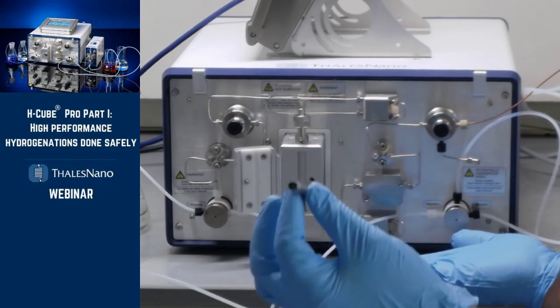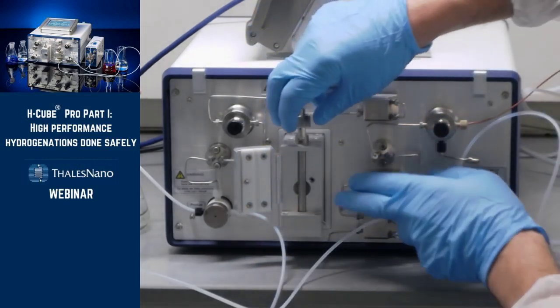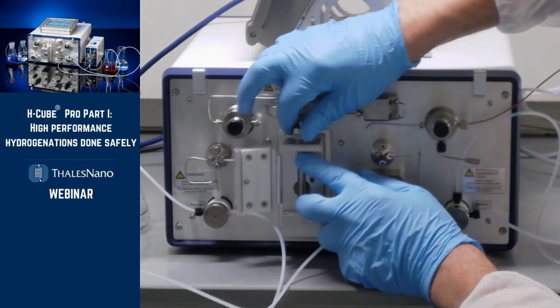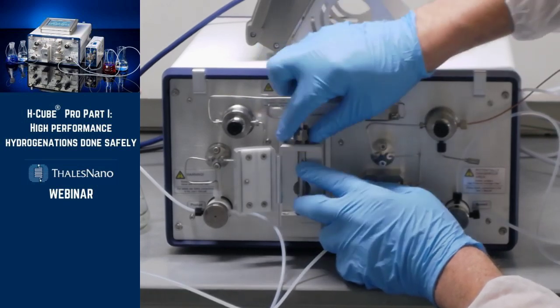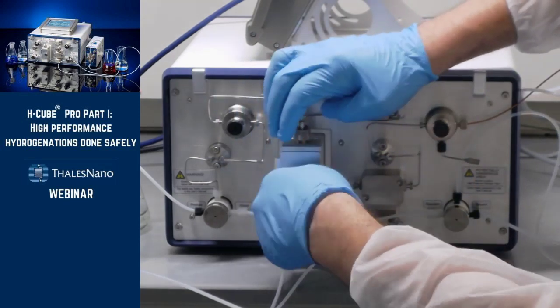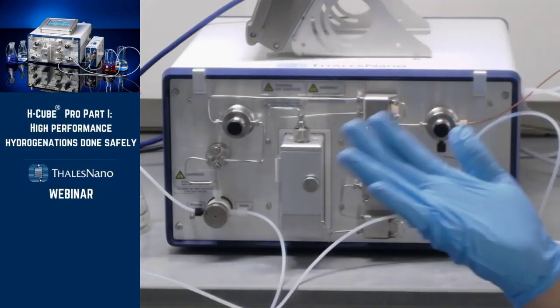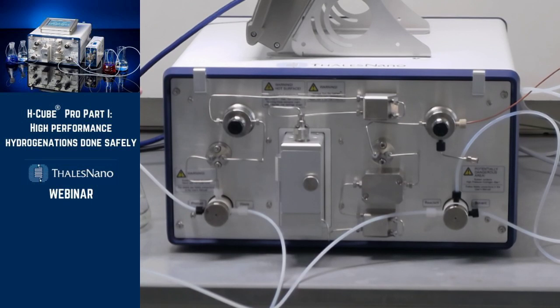If you want to place a cartridge in, what you need to do is you put in your cartridge, you keep it here with your hand and tighten it a little bit, but not too strong. Close the door and then a little bit more tight, and then you can start your next reaction.